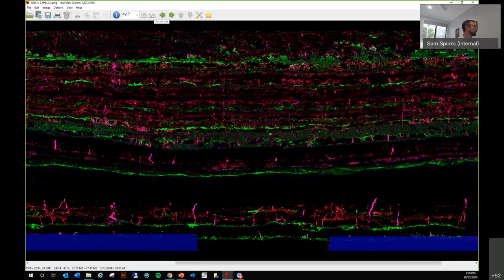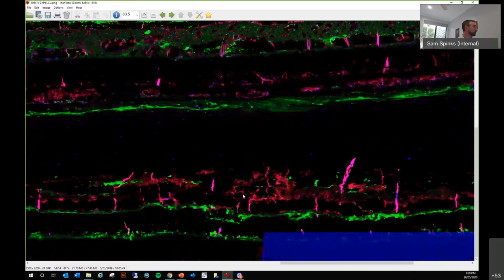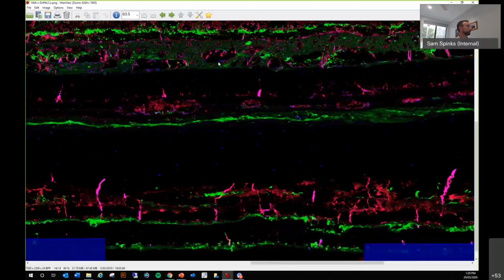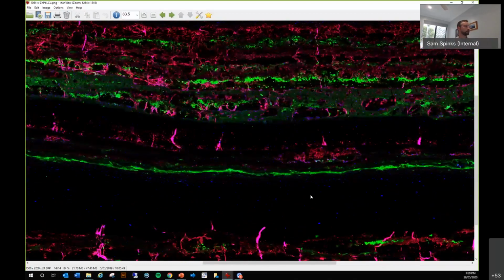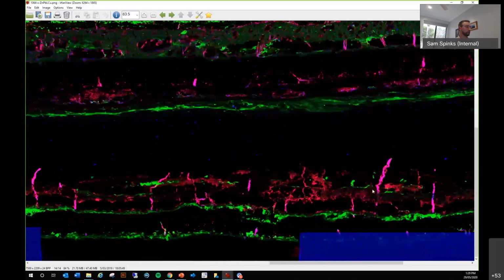And if you just let me jump back out of PowerPoint, we can look in more detail. What we see in these areas here is that we've got the usual carbonate associated sphalerite, which in this case is red, but the subvertical and vertical fractures are actually purple. So this is copper bearing sphalerite with some localized blue through here. That's more often than not chalcopyrite. So what we have in this sample in particular is two different end members of sphalerite, copper rich and copper poor, which occurs throughout the ore zone.